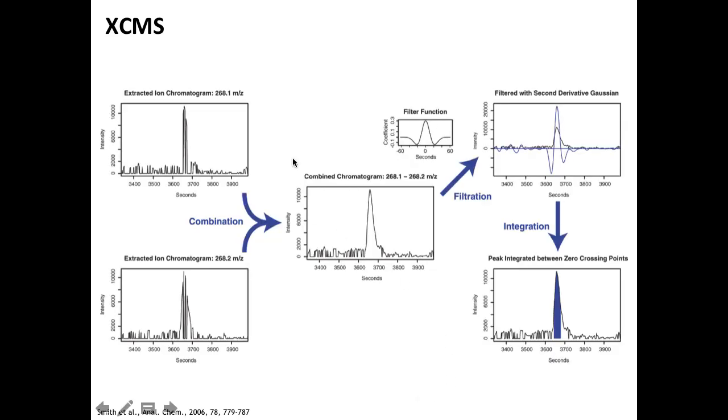This is what such an extracted ion chromatogram looks like. And you know, the binning is already part of the problem, because binning is not a very stable process. This is one of the reasons why these chromatograms don't really look all that nice, because they are often split across adjacent bins. And XCMS tries to fix that by combining them again. But ultimately, this discretization is a bit of an issue.